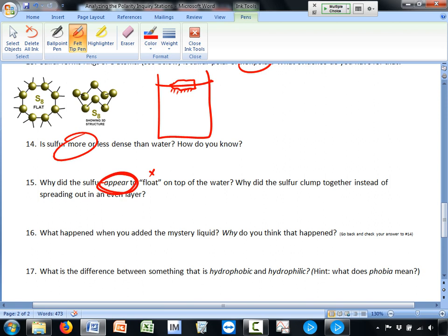Pretty neat, right? So first of all, a lot of times you'll see as soon as you hit that drop, the sulfur shoots to the other side. Did anyone see that? Which is really interesting. And sometimes if you're lucky, you'll even see that drop kind of attack this clump of sulfur, kind of like a paramecium. I didn't see that so much on Friday, but then you get this sulfur rain, like acid rain, and then eventually it all has ended up on the bottom.